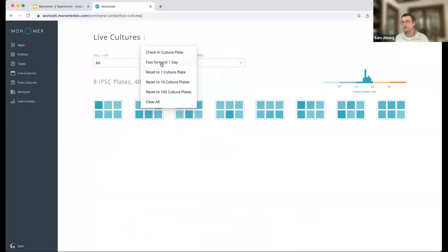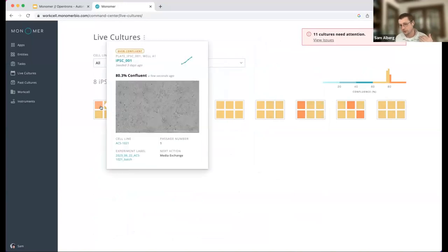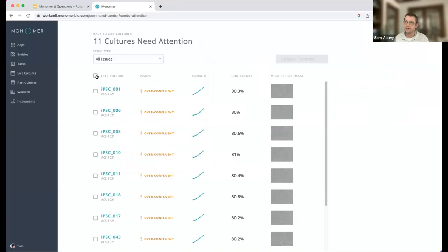One last example of this automatic detection or this analysis of these images is more of a positive example, which is we've set a threshold, a confluence threshold, that once we've hit that threshold, we want to queue up a passage. So here we have Monomer flagging our wells that have hit that number. And what we can do at this point is select our overconfluent cultures and schedule a passage.